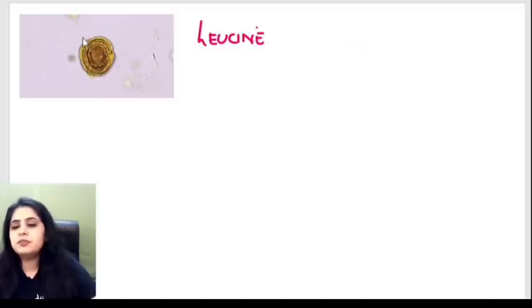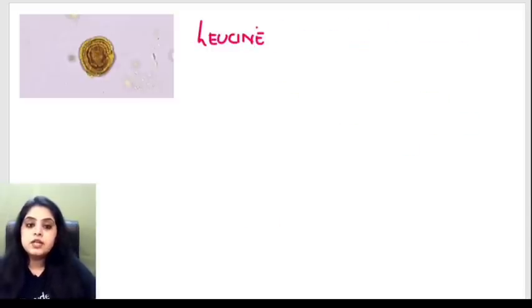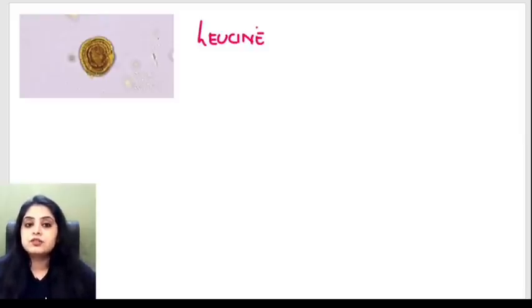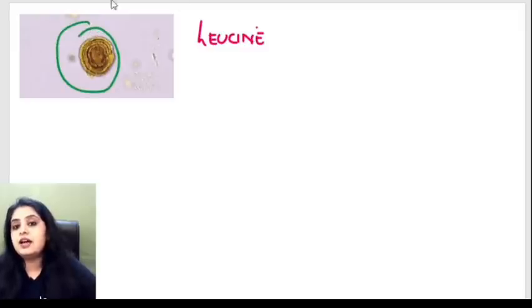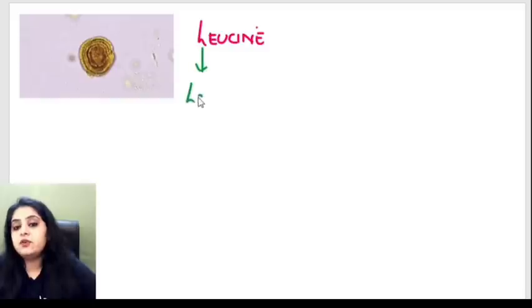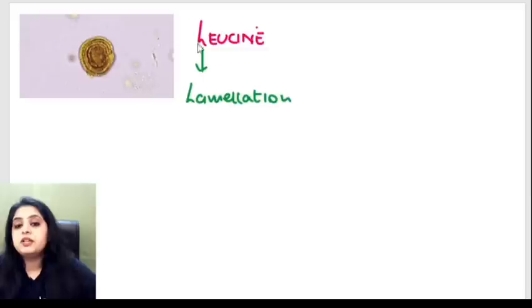This crystal looks like the bark of a tree — it's got those lamellations, like the cut surface of tree bark. When I see lamellations in a crystal I call them leucine crystals. 'L' for lamination, 'L' for leucine.